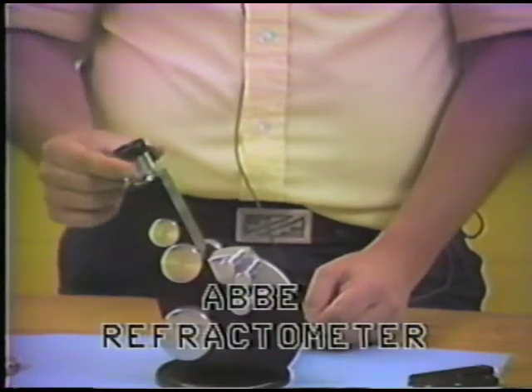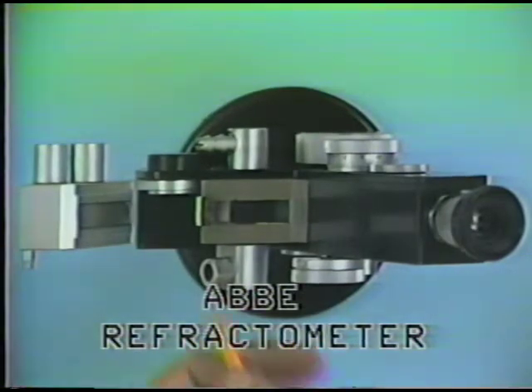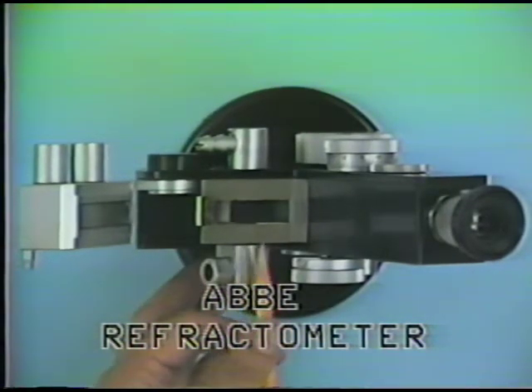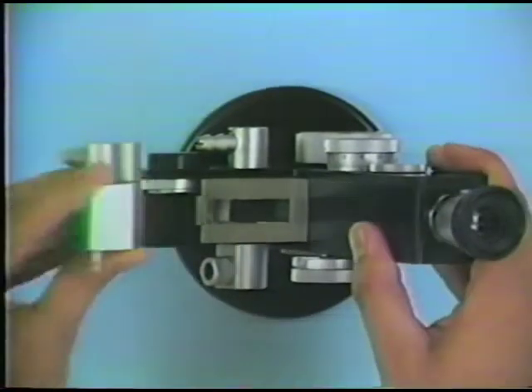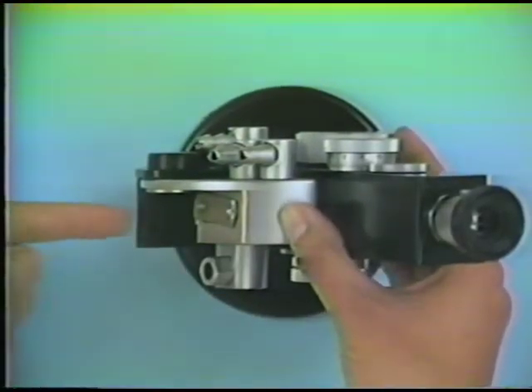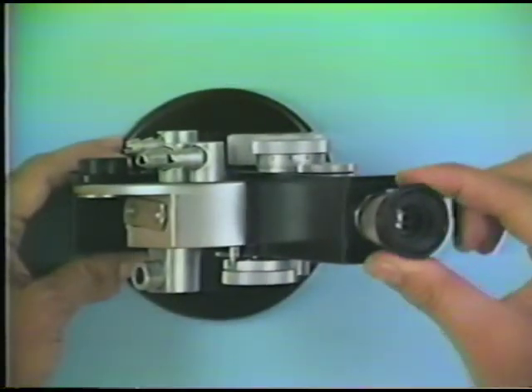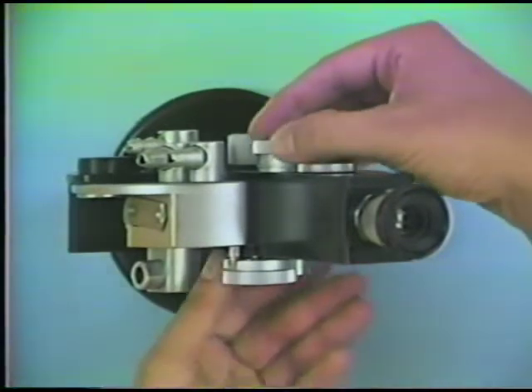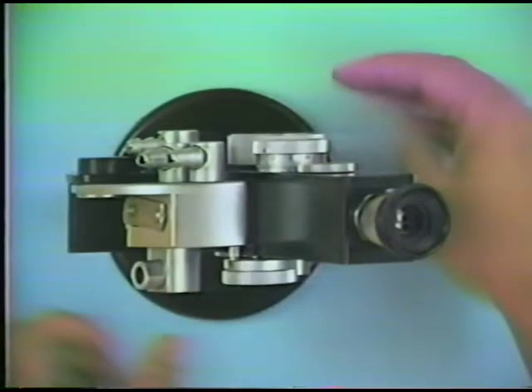There's a viewing tube here, which has an ocular in it, but there's a chamber on which there are two smooth surfaces, or prisms, and it's on this surface that you can put a drop of your immersion liquid right here in this location. Close the Abbe in this position, have a light directed in this side of the refractometer, which causes refraction to occur, and then you look down the tube and focus the refractometer to directly determine the index of refraction of any particular liquid.